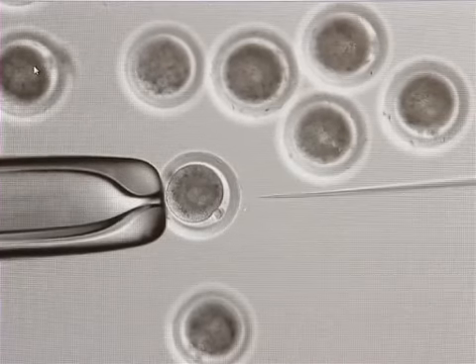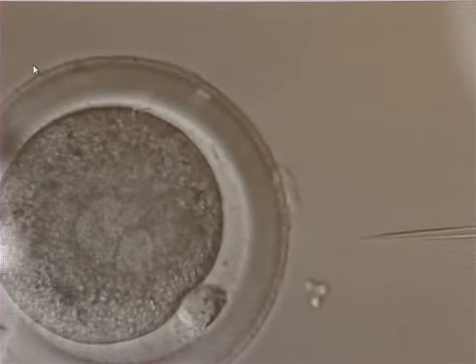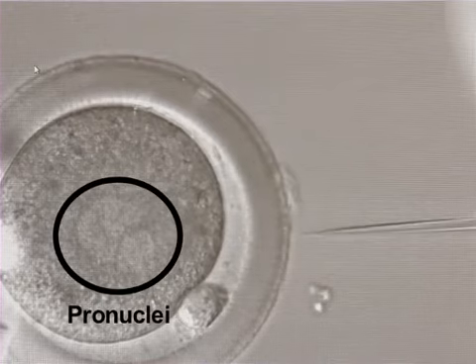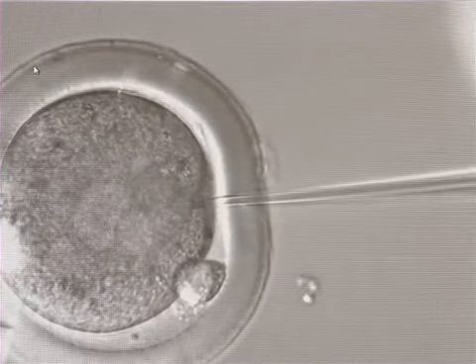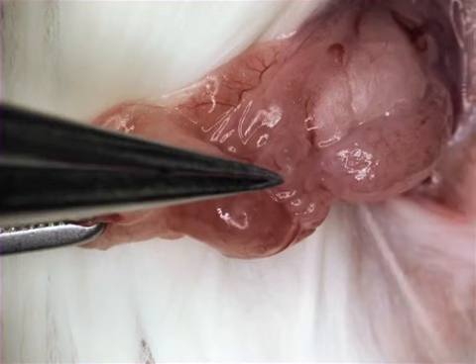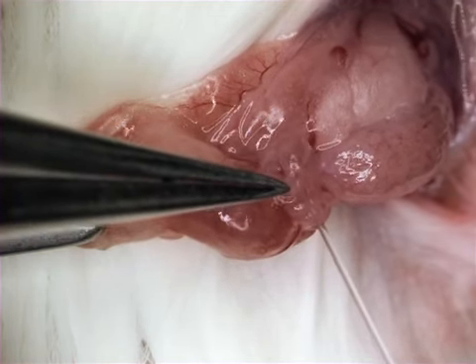In mice, transgenesis can be accomplished by manipulation of newly fertilized eggs in which the sperm and egg pronuclei have not yet fused. The construct is injected directly into the larger pronucleus, where it may integrate into the genome as the cell divides. The eggs must then be transplanted into the uterus of a pseudo-pregnant female for development.